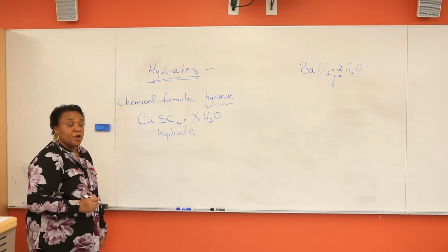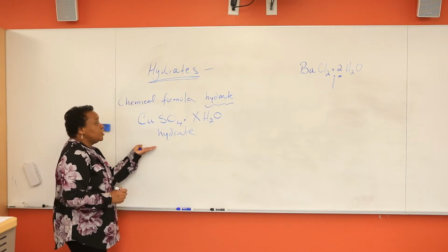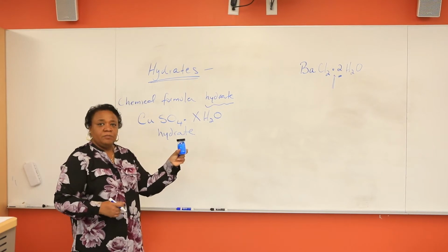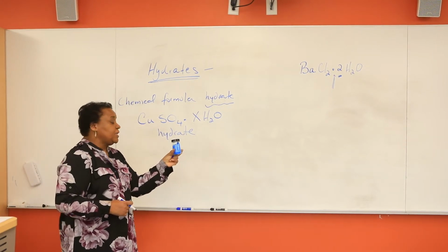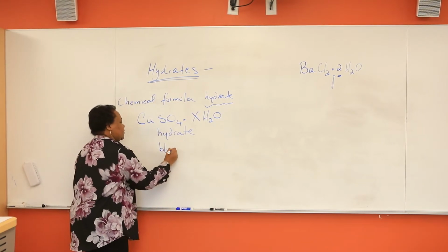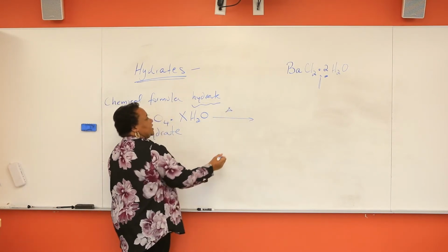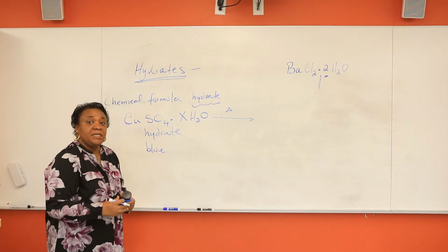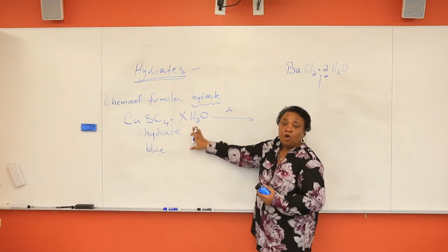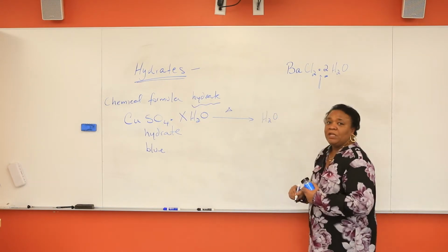And so in today's experiment, you're starting off with a hydrate of copper 2 sulfate. And please note, copper 2 sulfate with these bound water molecules is a blue crystalline solid. So it's blue in color. For some hydrates, on heating, and in chemistry we tend to use the symbol delta to represent heat, what do you think is going to happen? Well, if there are bound water molecules, the water usually evaporates. So the water molecule will evaporate.